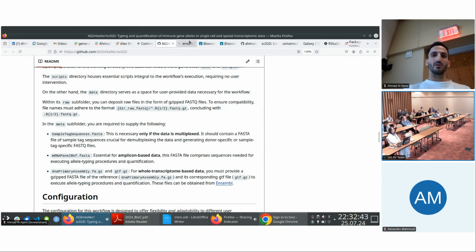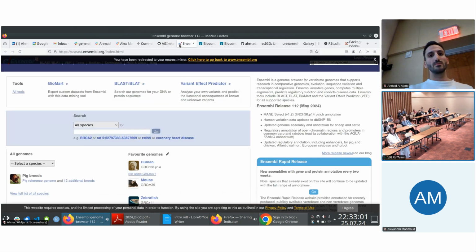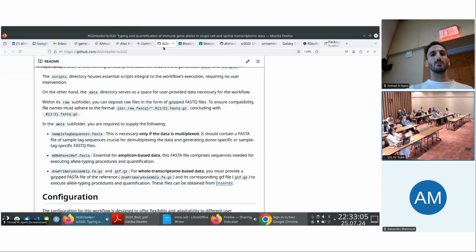Okay. I mean, the allele alignment is done with scIGD. Yeah. And it tries to infer the alleles that are present. Yes, exactly. And how could it, because some of them are similar to each other? Yeah. Is there still some kind of uncertainty, because here you just have some particular set of the final ones?